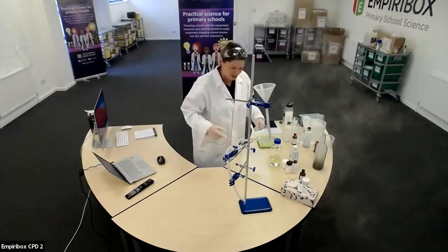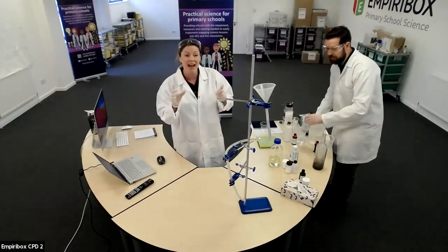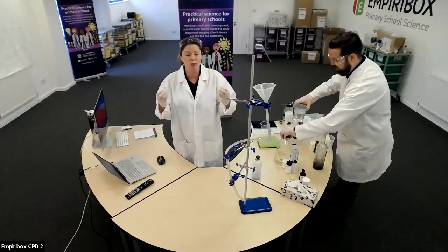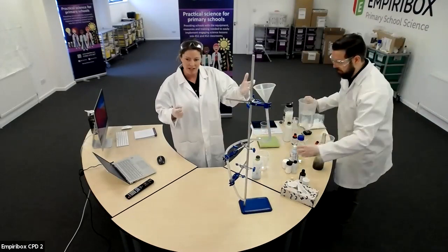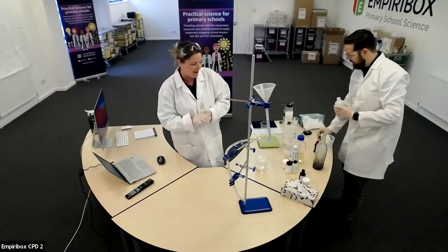Science never works when you want it to, does it? Honestly, no. So we can look at one of those telltale signs that tell us that two chemicals have reacted together to produce something different, a product. And I do need to put my safety goggles on, thank you, I have not forgotten.